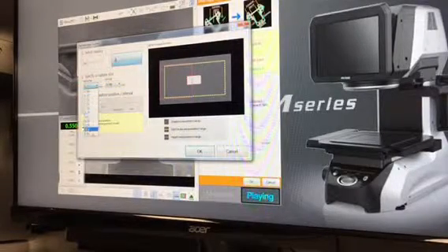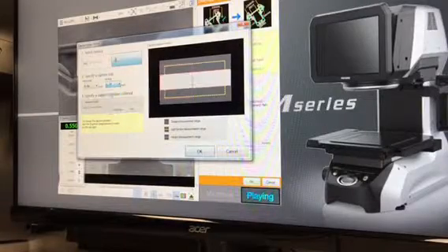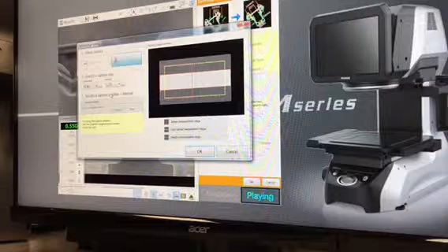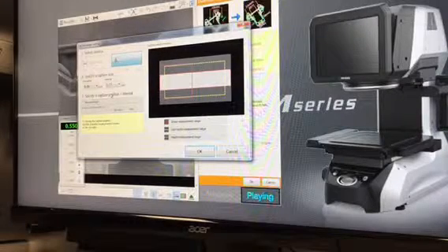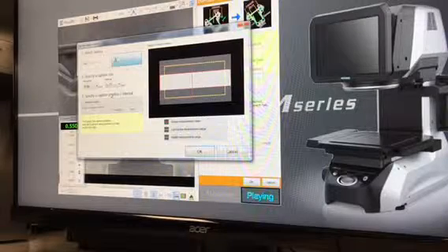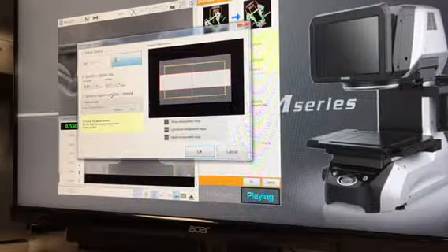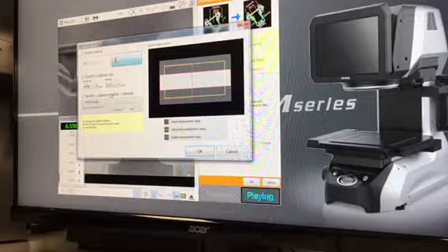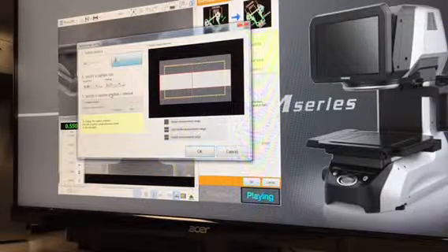And now I can use those same optimal lights and adjust the area. So you write the program off one part, just in the one, without the stage moving at all. Yes, so you can use optimum illumination.